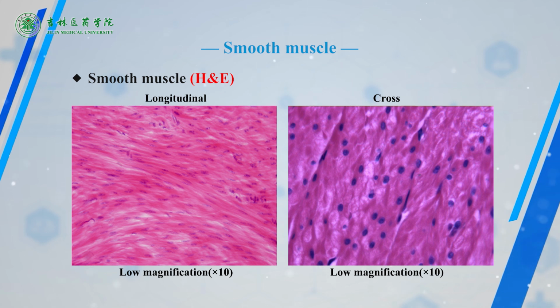There is also a centrally placed nucleus because of staggered arrangement of the cell. The cross-sectional profiles vary in size, and only the largest profiles contain section of nuclei.